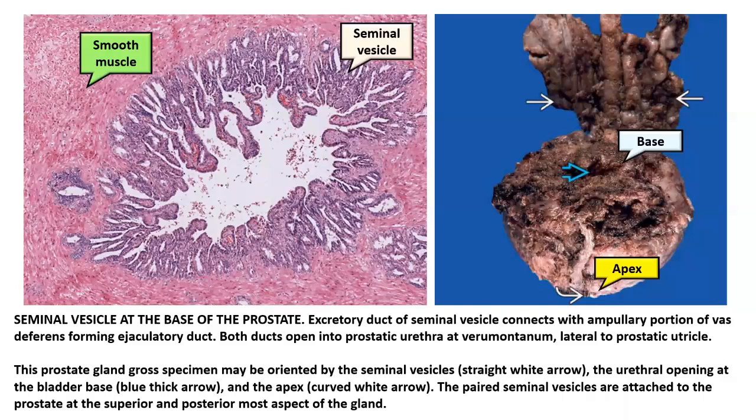We shall be talking about how we can separate a conventional acinar adenocarcinoma from misdiagnosed seminal vesicle glands. Subsequently, there are some important histological features that you need to make note of in order to differentiate between the two. And this is the gross orientation, which we have already talked about. The insertion of the seminal vesicle and the ductus deferens is always on the posterior superior aspect at the level of the base of the prostate.